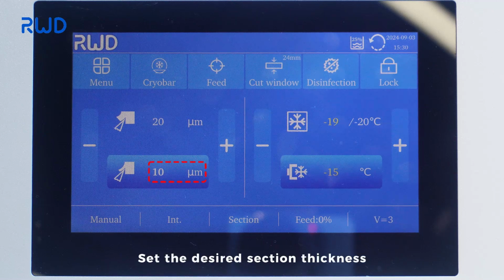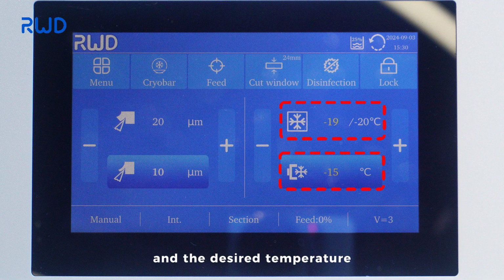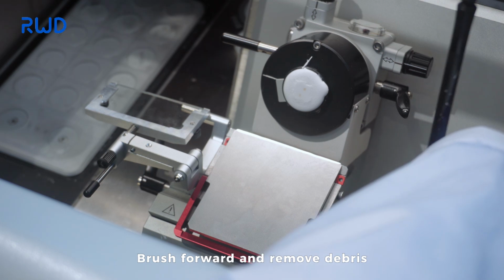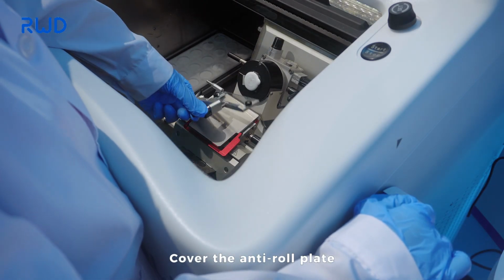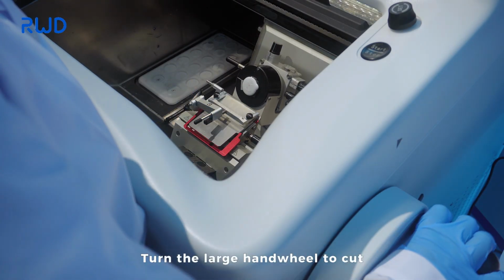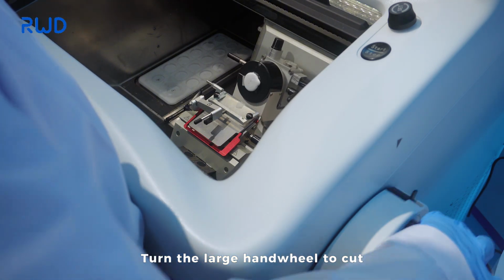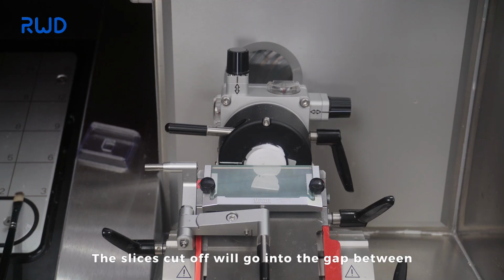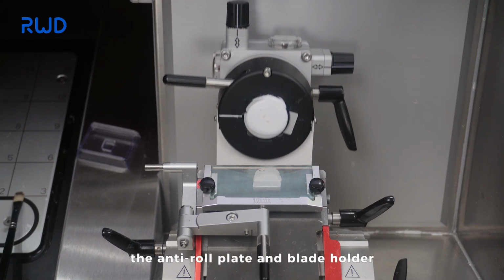Set the desired section thickness and the desired temperature. Brush forward and remove debris. Cover the anti-roll plate. Turn the large handwheel to cut. The slices cut off will go into the gap between the anti-roll plate and blade holder.